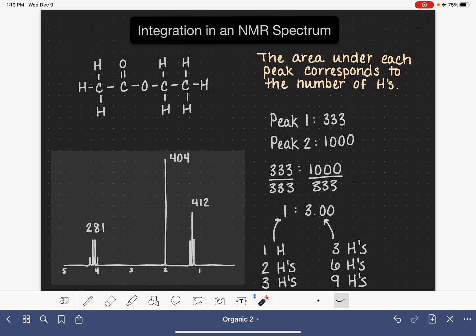If we know the exact number of hydrogen atoms, we would be able to correctly identify which one of these ratios was the true ratio of hydrogens in the molecule.